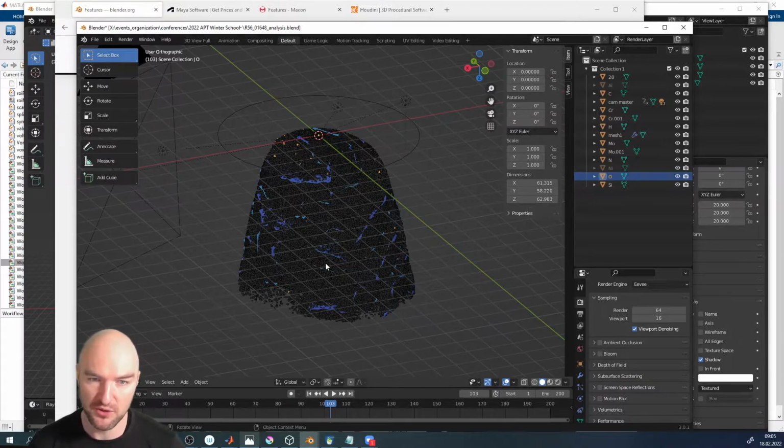So what we are going to do today is to learn how to outline something that cannot be outlined by an isosurface, and that's actually quite a lot of objects. We've already started yesterday looking into what object dimensionalities we could have. We could have 0D, 1D, 2D, 3D. And today we're going to look into how we can create analysis objects from any topology.